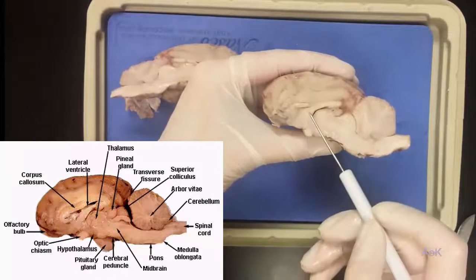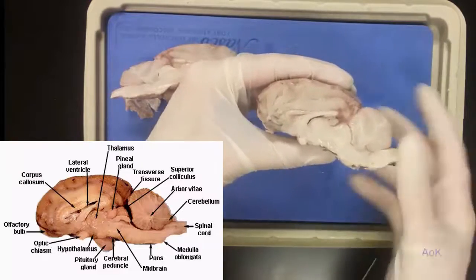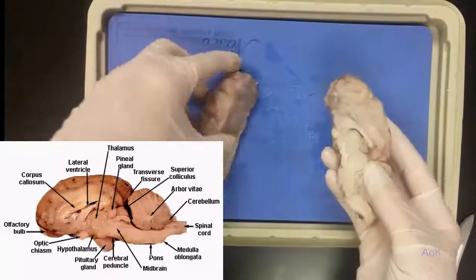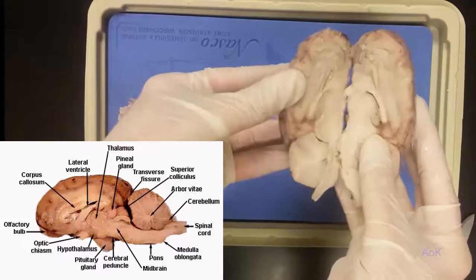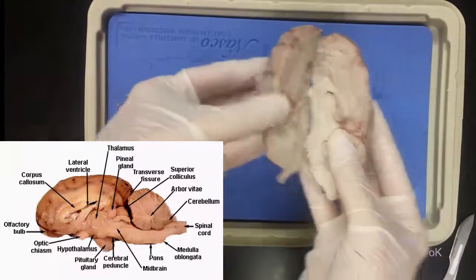You also see this very large white structure. That's the corpus callosum, which connects the left and the right sides, and it allows the axons from the left and the right sides to connect to the other side of the brain and communicate.